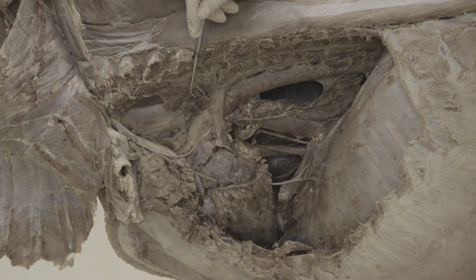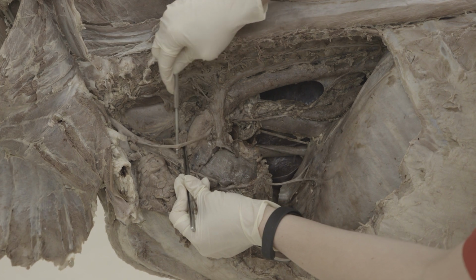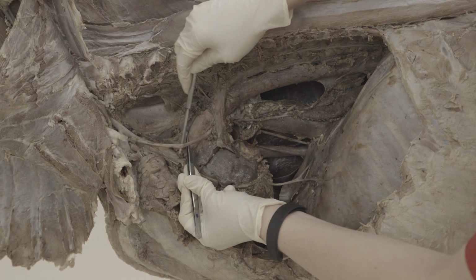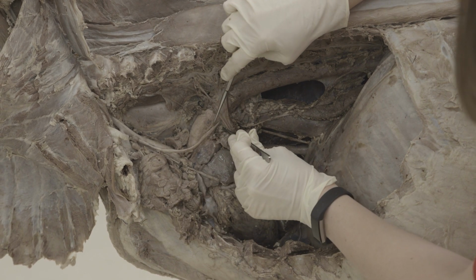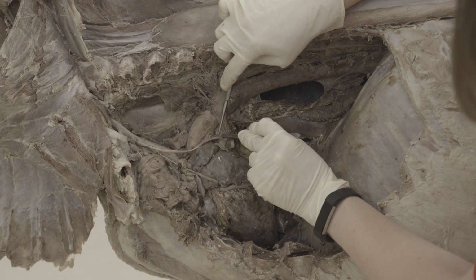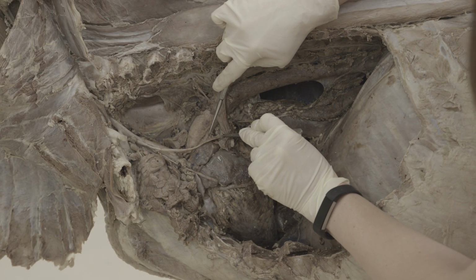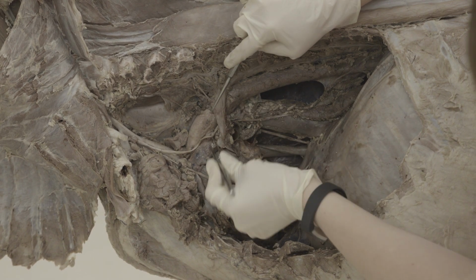We'll find the vagus nerve first. So the vagus nerve is this one right here. So that's going right by the base of the heart, so right by the lungs as well, because we cut out the lungs here. So you want to find that vagus nerve, and then you can try and find the left recurrent laryngeal nerve coming off of the vagus, but it can be pretty difficult to see. And so it's going to come off, I don't know if you can see it right there, coming off, and it's wrapping around the aortic arch. Then it will go back up the trachea on the left side. So the left recurrent laryngeal nerve coming off of the vagus nerve.